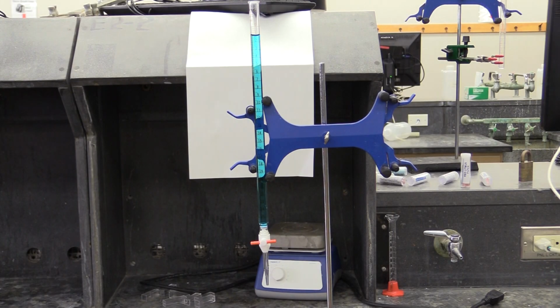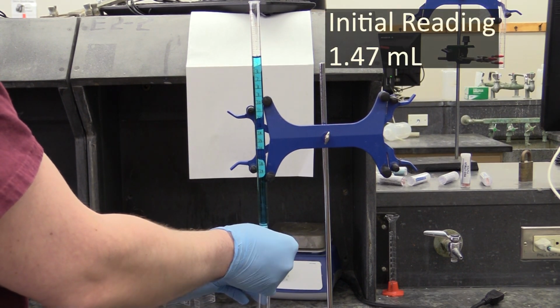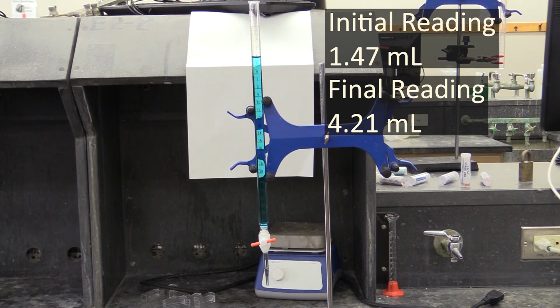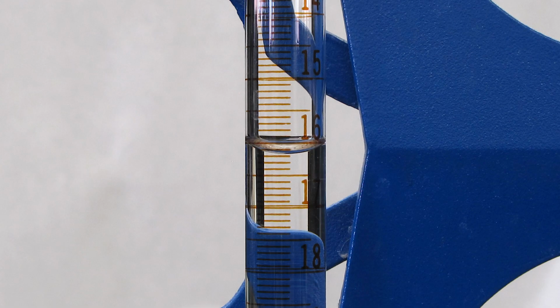To dispense fluid from a Buret, you take an initial reading, open the valve to dispense the volume you need, then take a final reading. You then calculate how much solution you dispensed by subtracting the initial reading from the final. The second thing to know about using a Buret is you have to take your readings to the hundredths place.